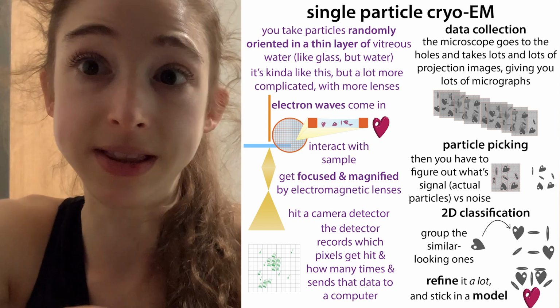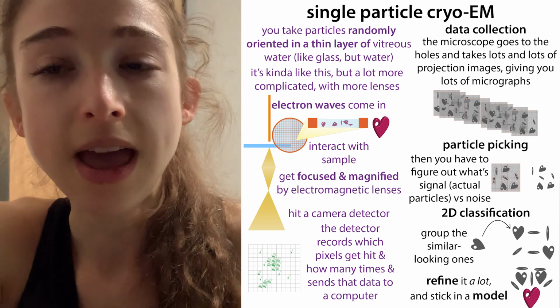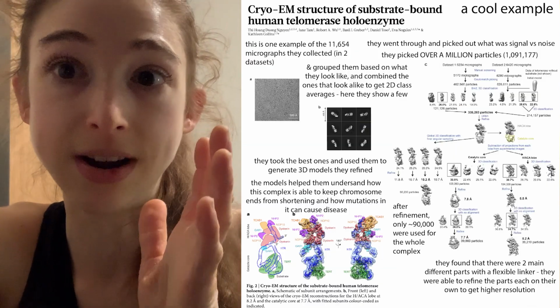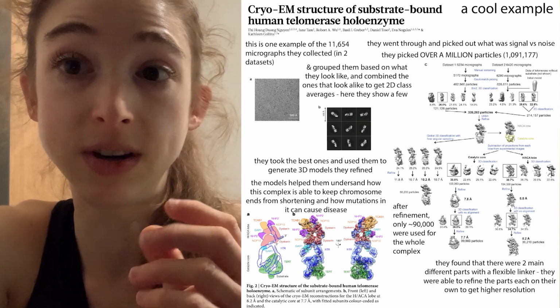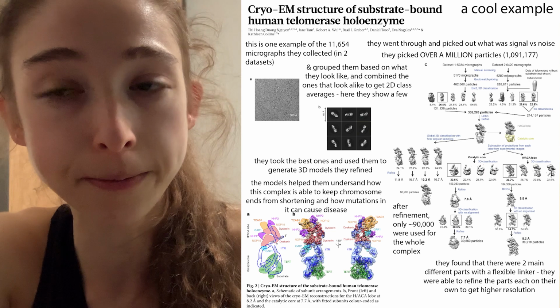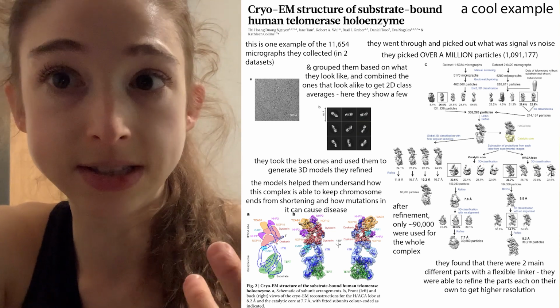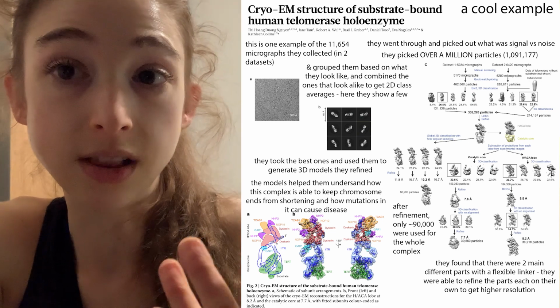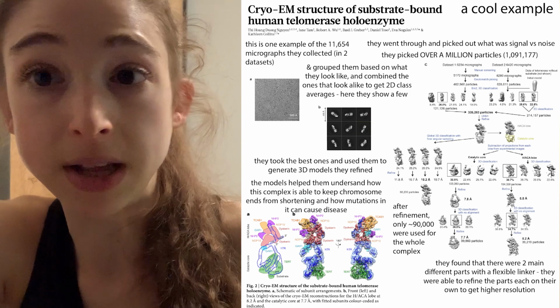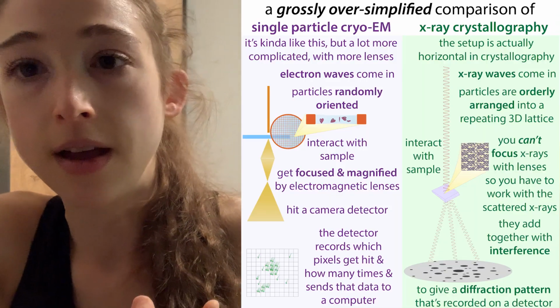So with X-ray crystallography, your biggest issue is trying to figure out the phasing, and with cryo-EM, your biggest issue is also often trying to figure out the contrast. So what is my sample? What is the particle versus the background, because they kind of blend in together. And also just various software, lots and lots of technological improvements on the software side for cryo-EM, as well as a lot of improvements in X-ray crystallography.